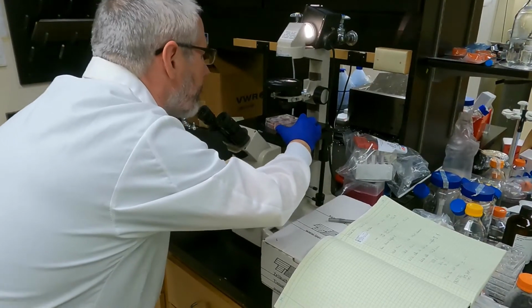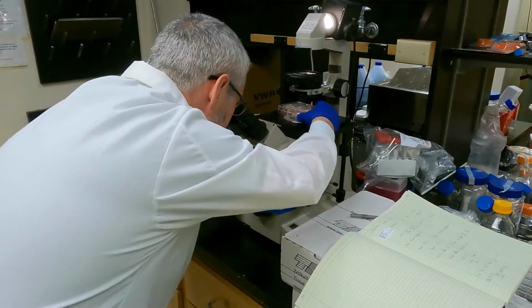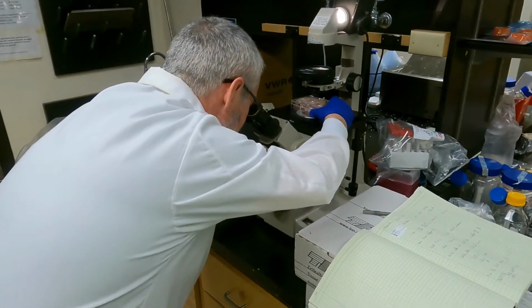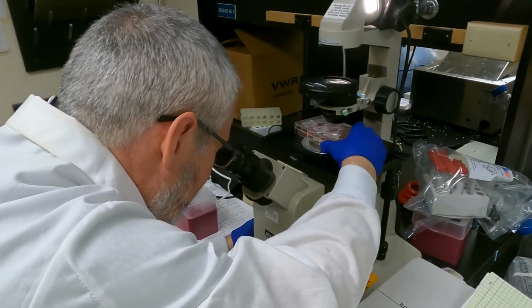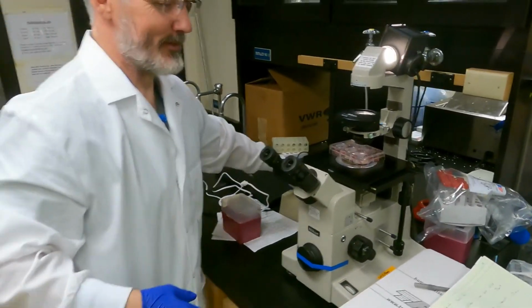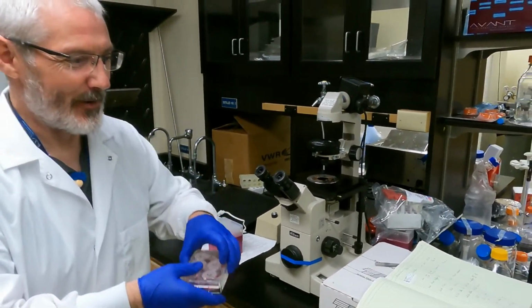Yeah, they look really good. I'll look at the GFP, because sometimes the DNA is a bit rougher than the Cas12a complex. If it was going to be a cell, I'd prefer to have the Cas12a complex rather than the DNA. The DNA seems to kind of hurt them. Okay, good. Finished.